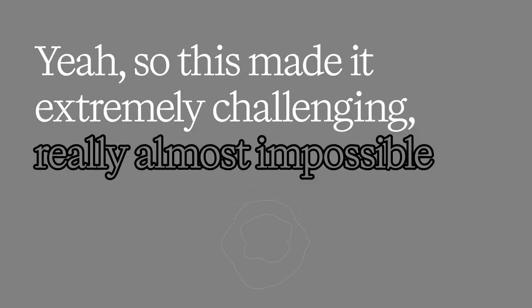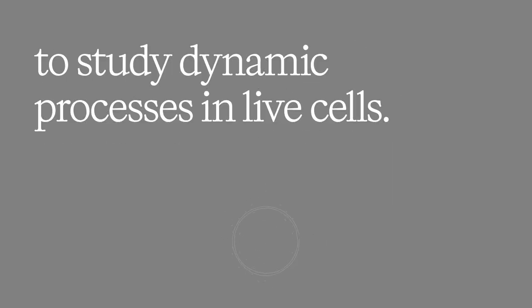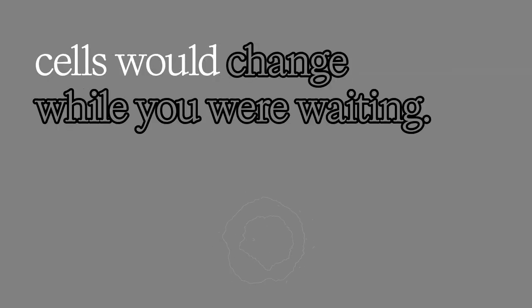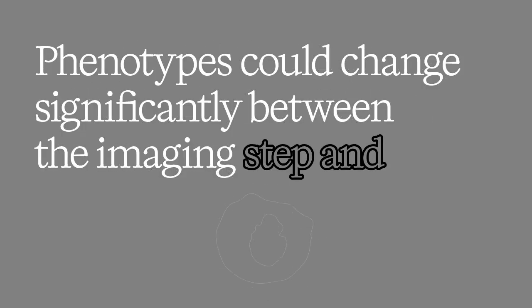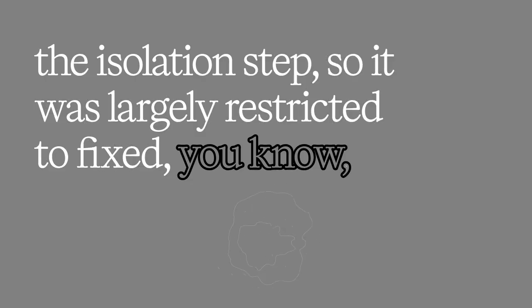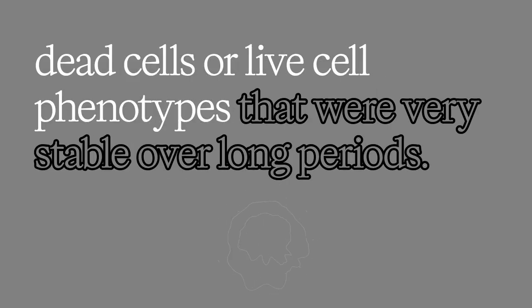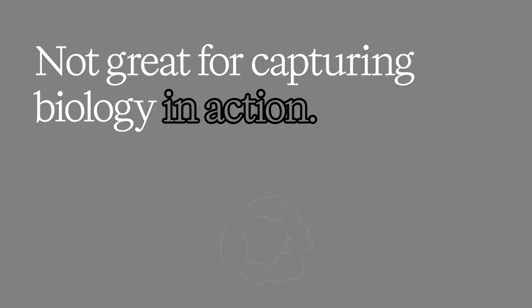8 hours. Yeah. So this made it extremely challenging, really almost impossible, to study dynamic processes in live cells, things that change quickly. Because the cells would change while you were waiting. Exactly. Phenotypes could change significantly between the imaging step and the isolation step. So it was largely restricted to fixed, dead cells or live cell phenotypes that were very stable over long periods. Not great for capturing biology in action.